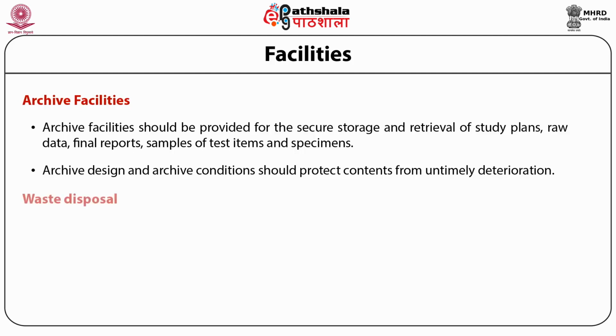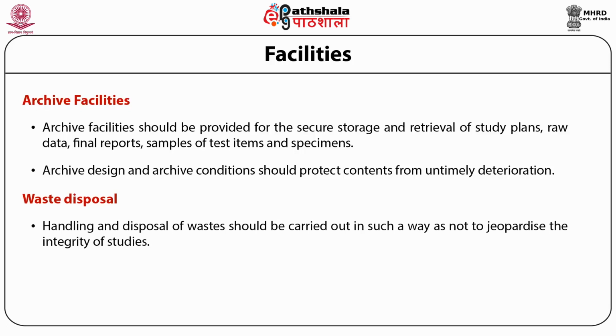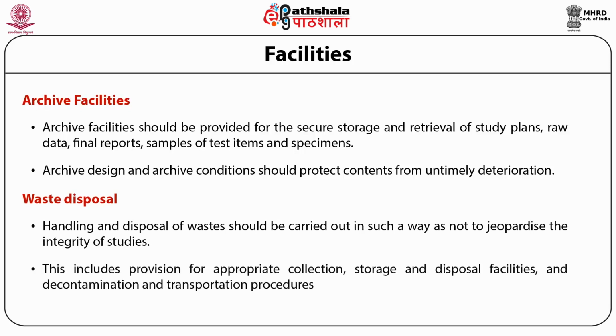The last one is the waste disposal mechanism. The handling and disposal of waste should be carried out in such a way as not to jeopardize the integrity of the study. This includes provision for appropriate collection, storage and disposal facilities, and decontamination and transportation procedures. The apparatus, materials and reagents.